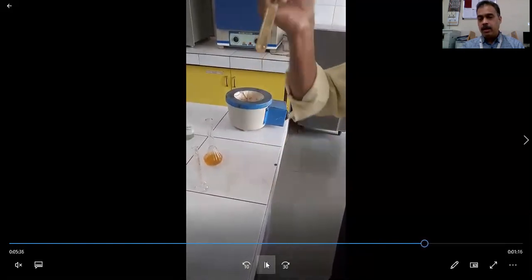The diameter and the length of each test tube should be the same. And for the first test tube, we took 1 ml of filtrate and 9 ml water. We are adding into the first test tube. Once it is done, we have to shake it. The same person should shake all the test tubes, because if different persons shake, the speed and the way of shaking will differ, and the formation of foam will change.